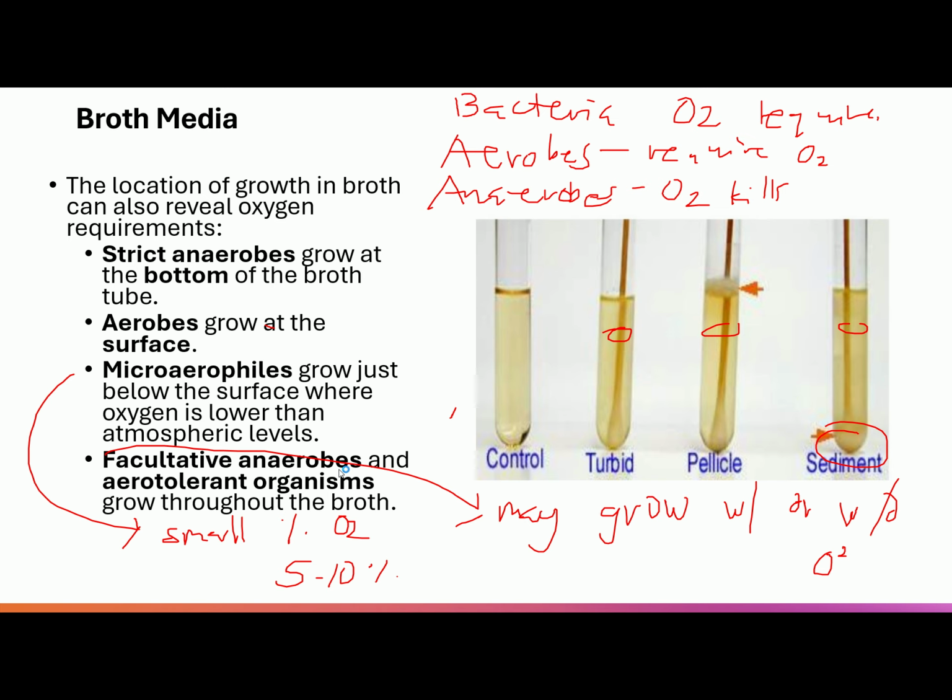Ang anaerobes ninyo, they are not allowed to be exposed to oxygen. But if they are facultative anaerobes, okay lang. They can still grow even in the presence of oxygen. So growth would be spread throughout the broth. So kung turbid siya, may mga floccules, possible na facultative anaerobe.